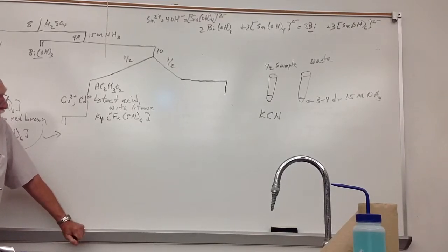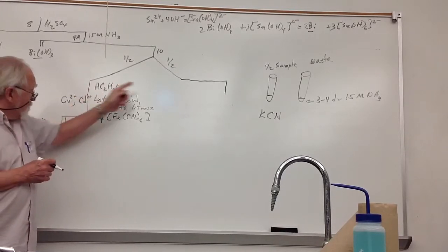Okay, so coming back to that, I check it. If it's not basic enough, I will ask you to add more ammonia, so you do that. So you go back and add some more 15 molar ammonia. And lots of times what people do is they mix up this instruction with this one.